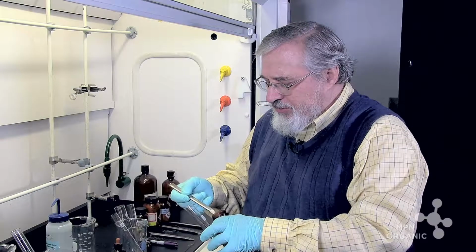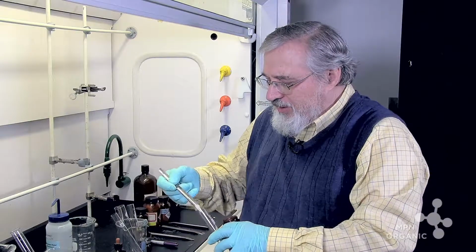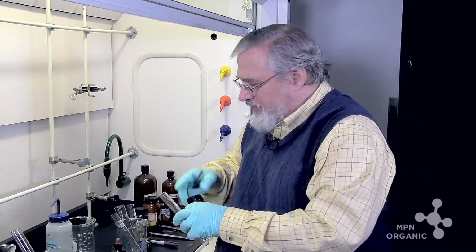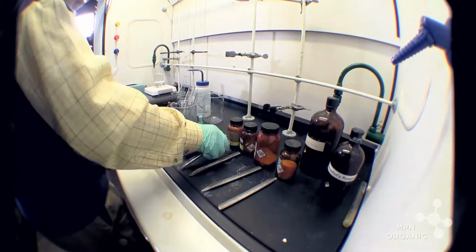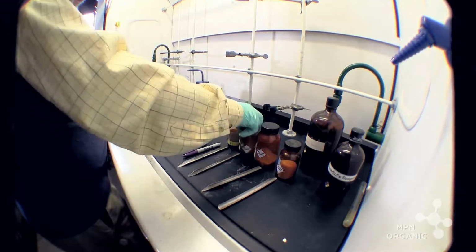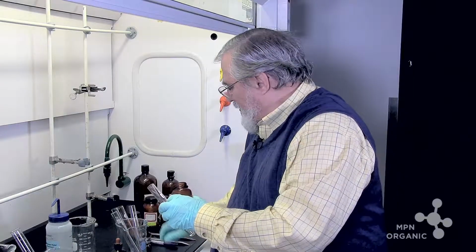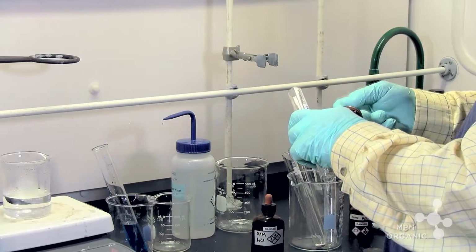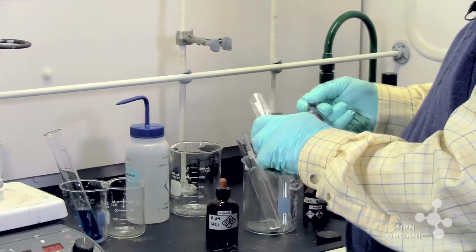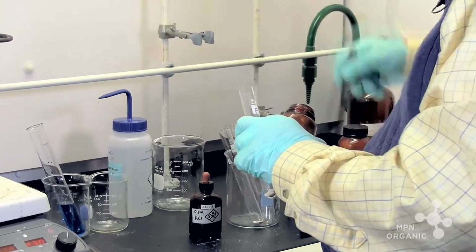Here's glucose. Now, these are very water soluble, so they make great solutions. There's glucose. Fructose.